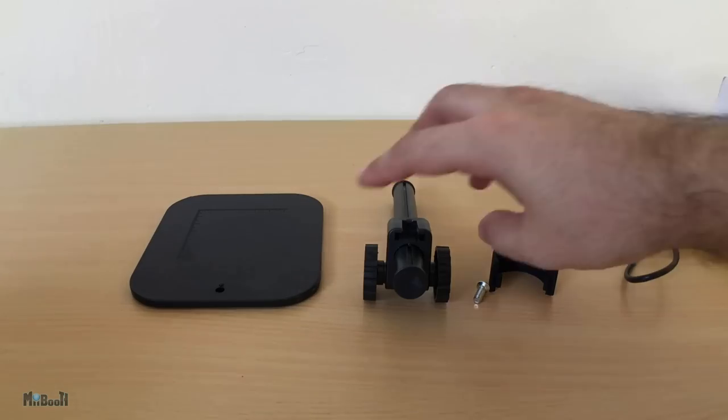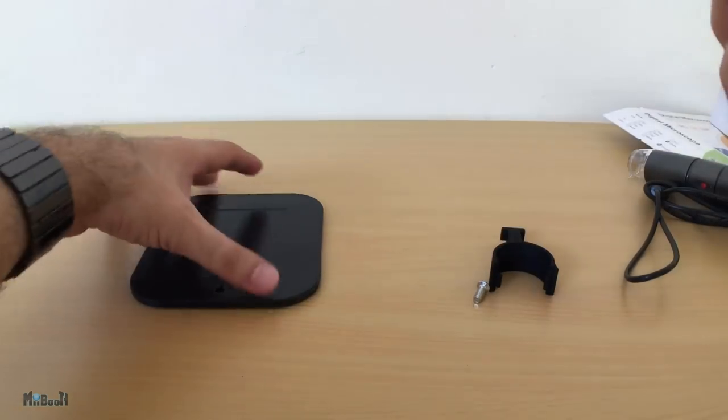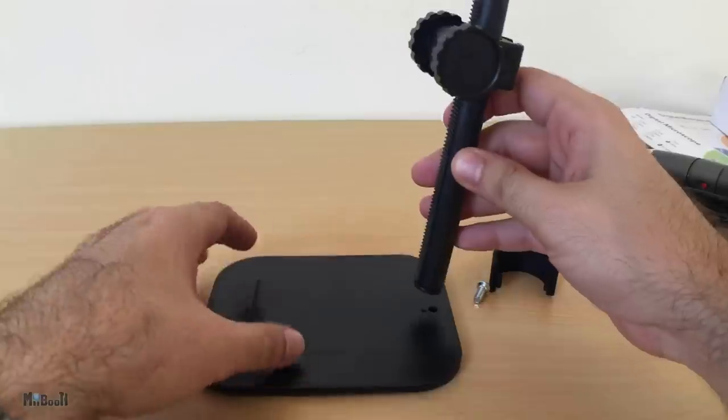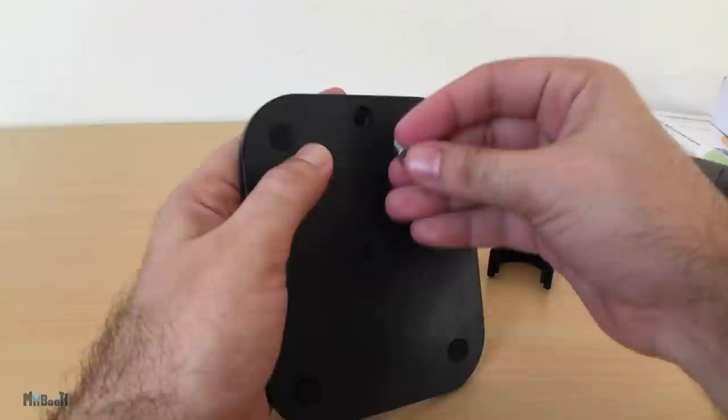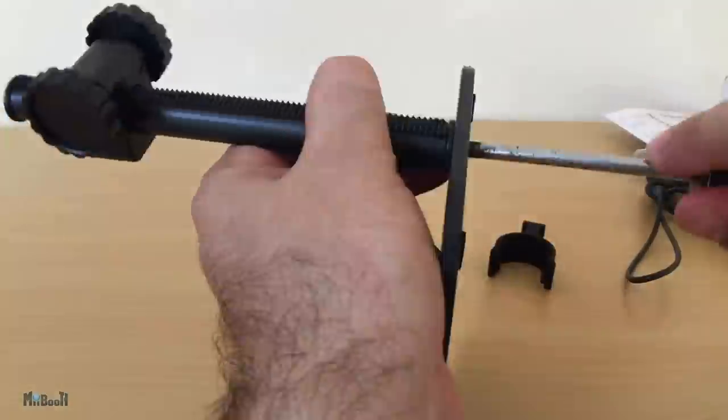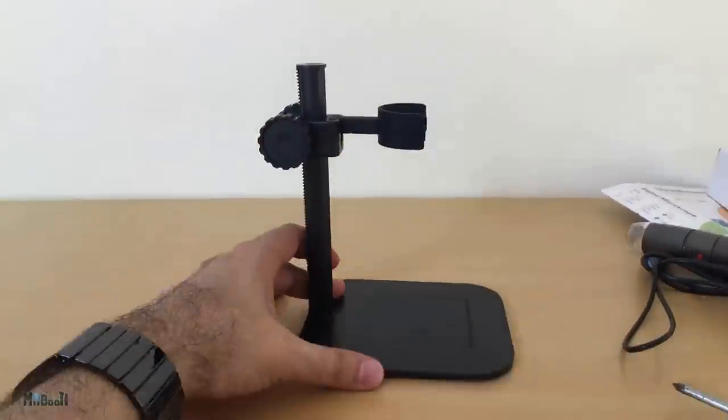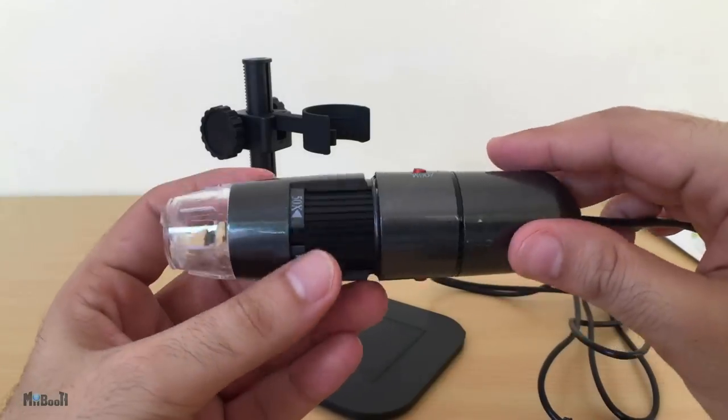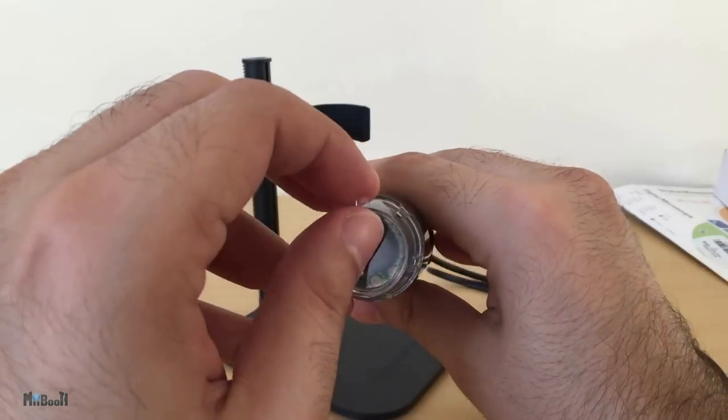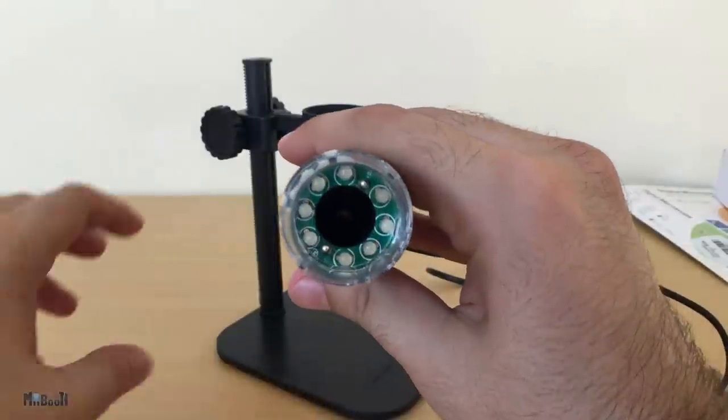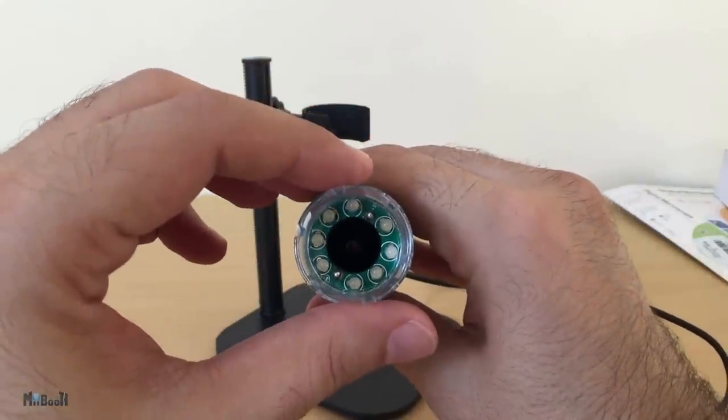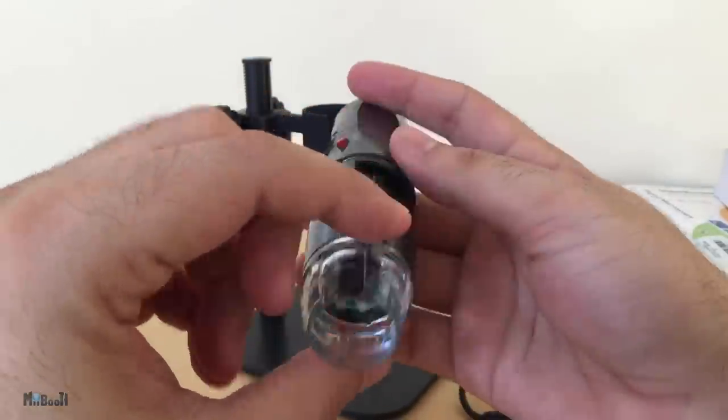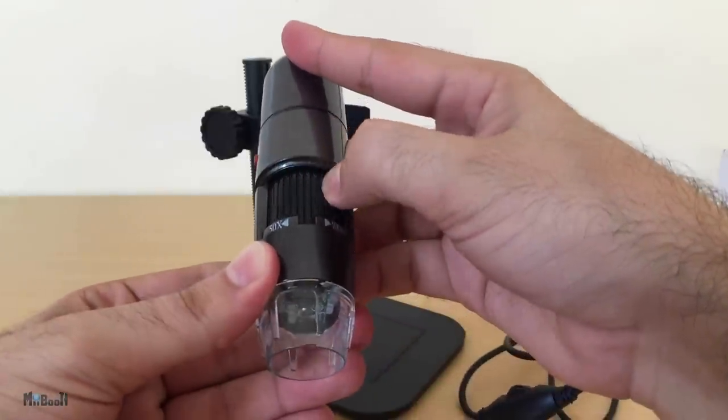Let's set it up now. The stand is very simple to assemble. The rod goes into the base plate, screw from the bottom to hold the rod in place. Microscope holder goes in here, and with that our stand is ready. This is our microscope. The lens is in here, it has a protective cap over it. We'll get rid of that for now. It has eight white LEDs in there to illuminate the object.